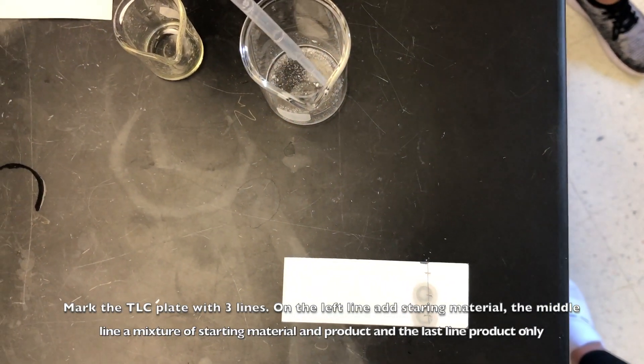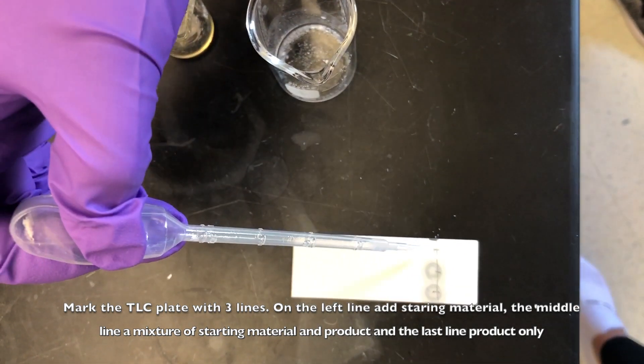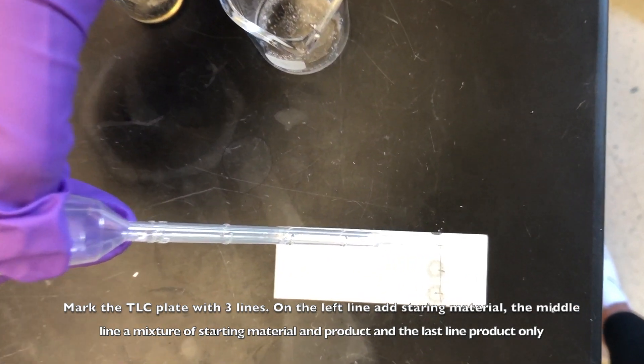Mark the TLC plate with 3 lines. On the left line, add the starting material. The middle line, a mixture of the starting material and the product. And the right line, only the product.